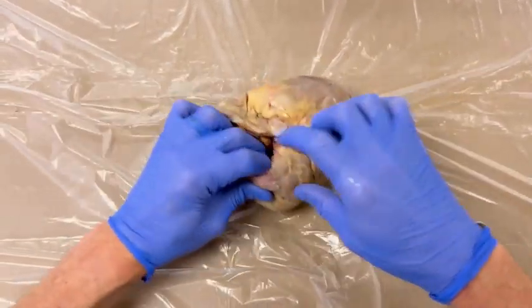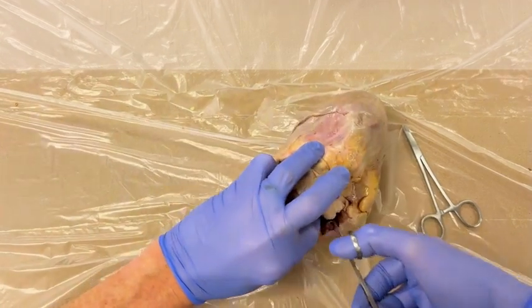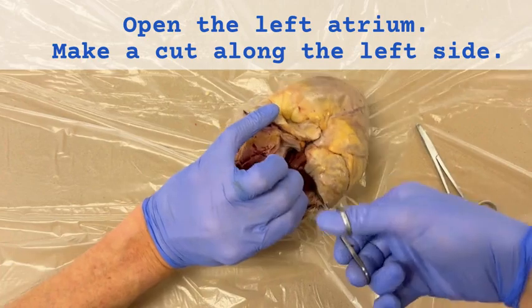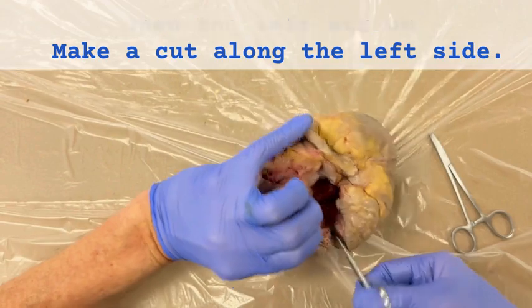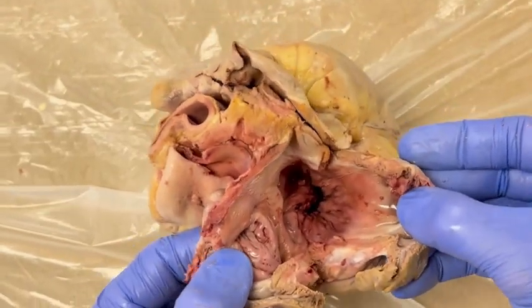And so we're going to take this side, and then we're going to open up the left atrium, just like we opened up the right atrium, making a cut all along the left side. And that exposes the left atrium.